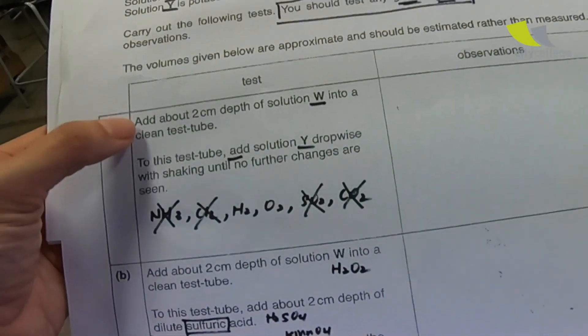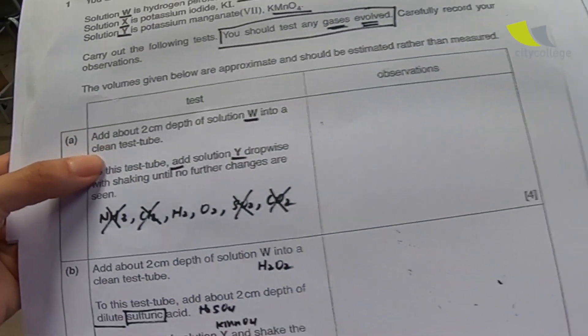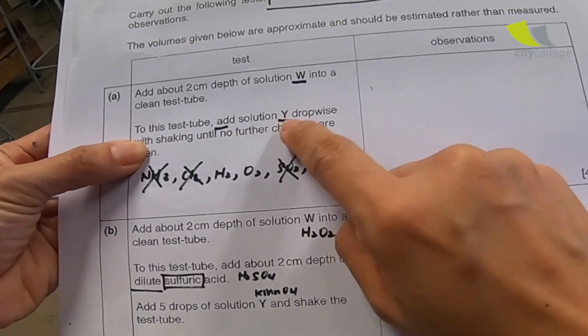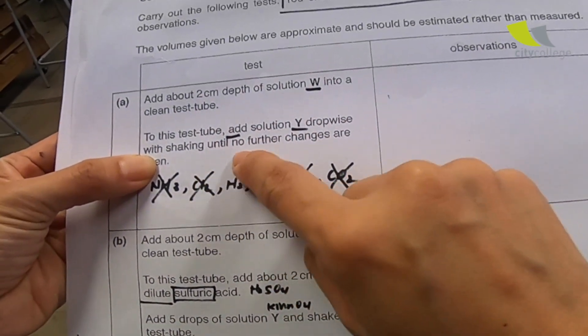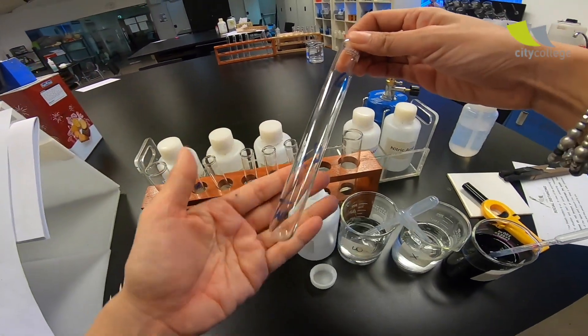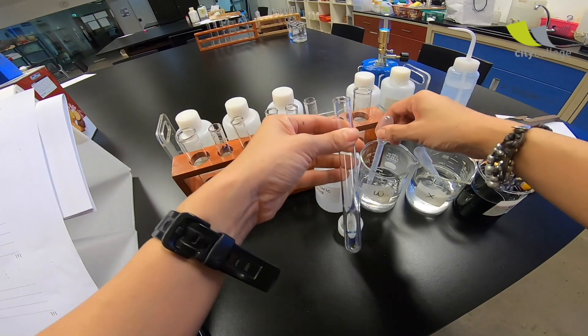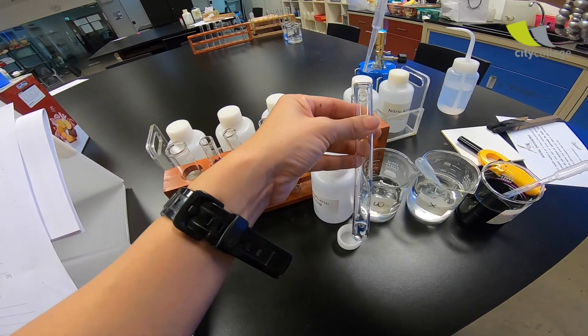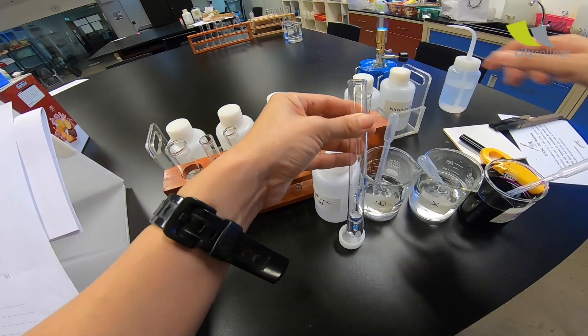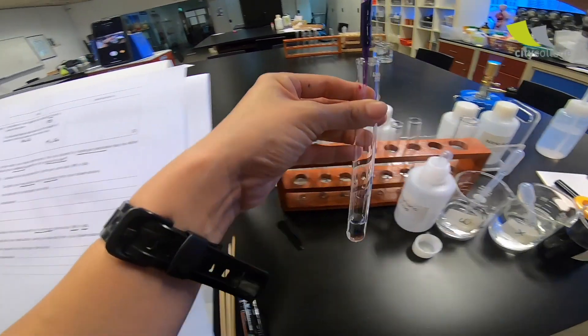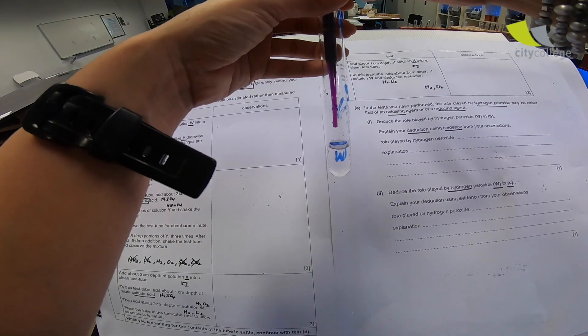Come, let's begin. They say over here, add about 2 cm depth of solution W into a clean test tube. To this test tube, add solution Y dropwise with shaking until no further changes are seen. Part A, add W. This is my Y, dropwise. So let's come to here so that everybody can see. Dropwise, drop by drop.